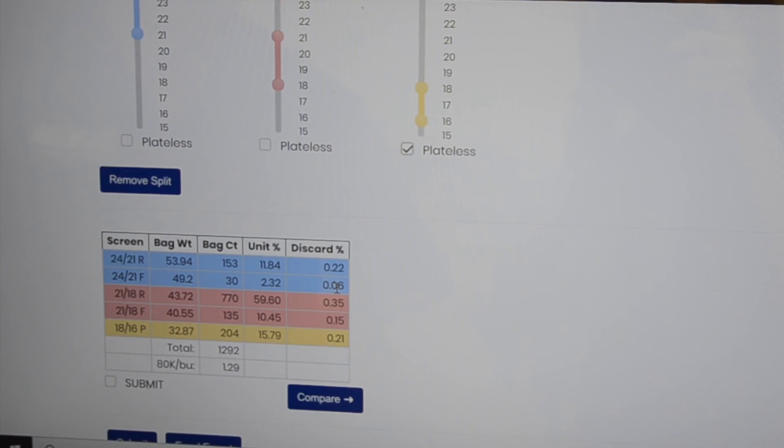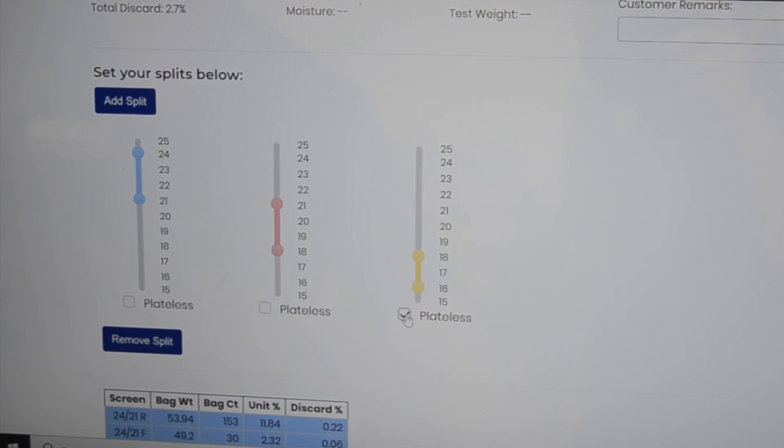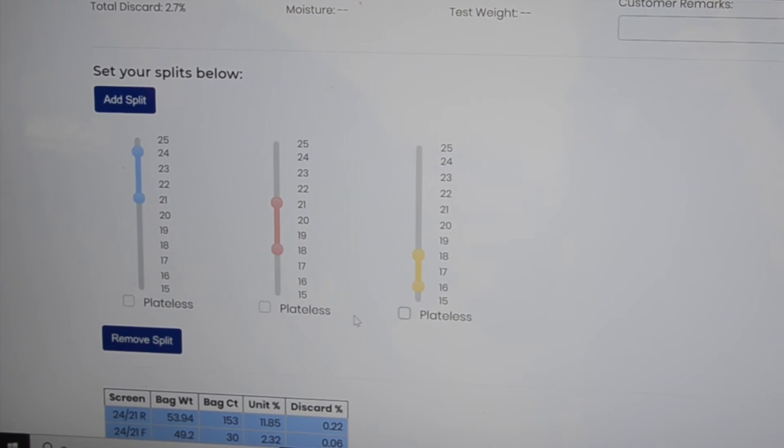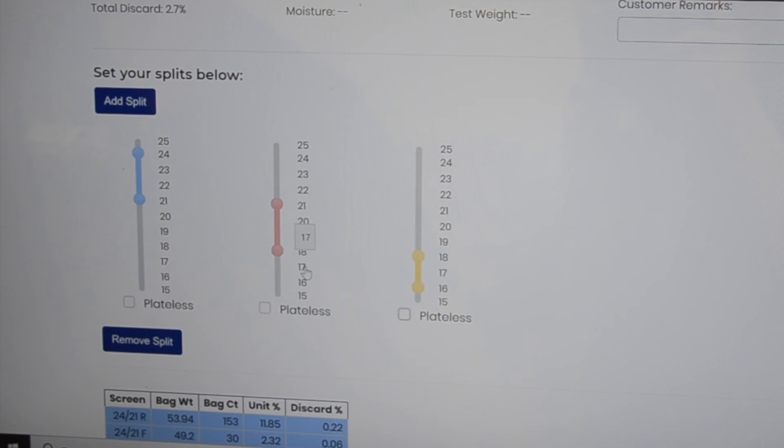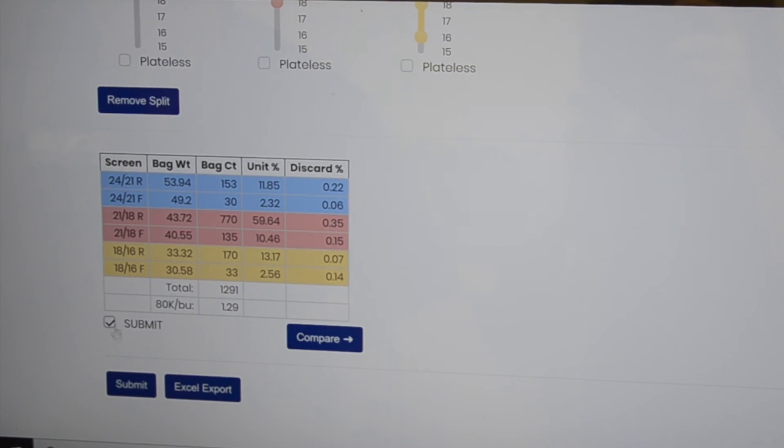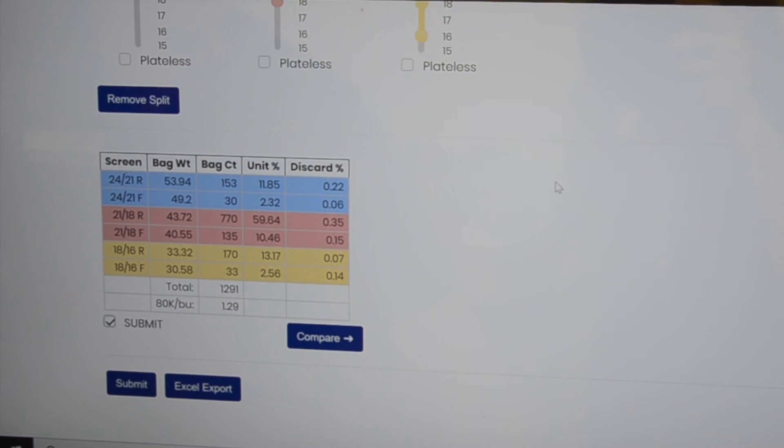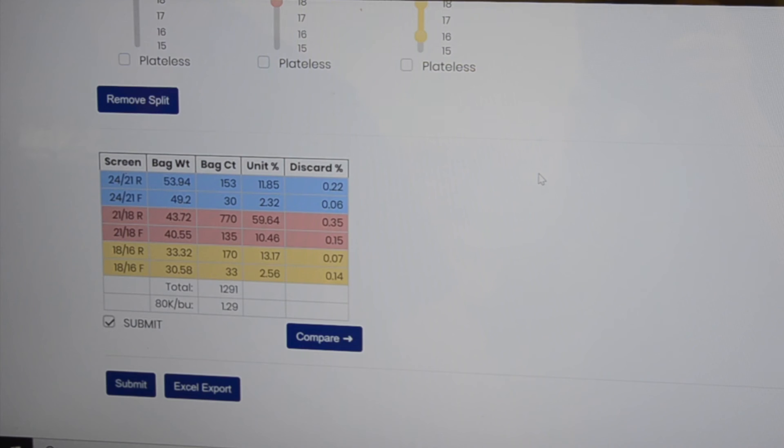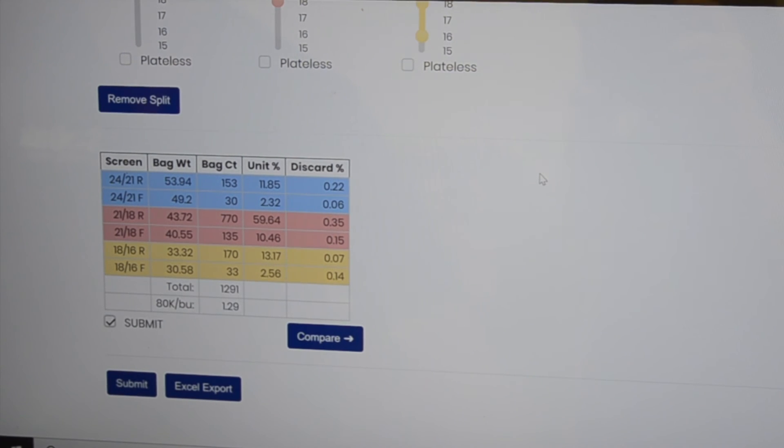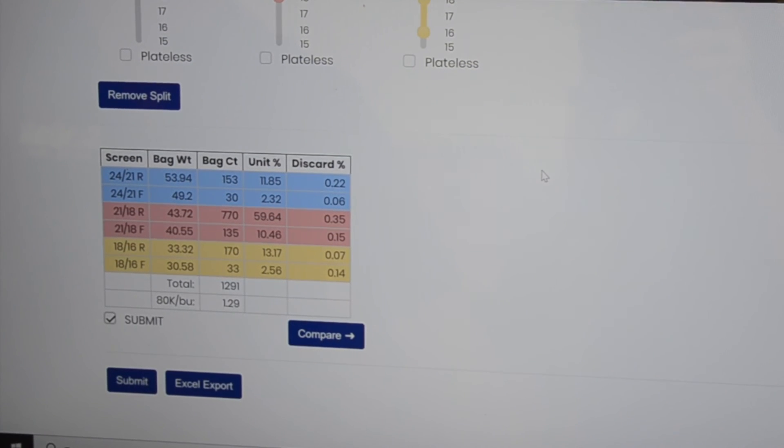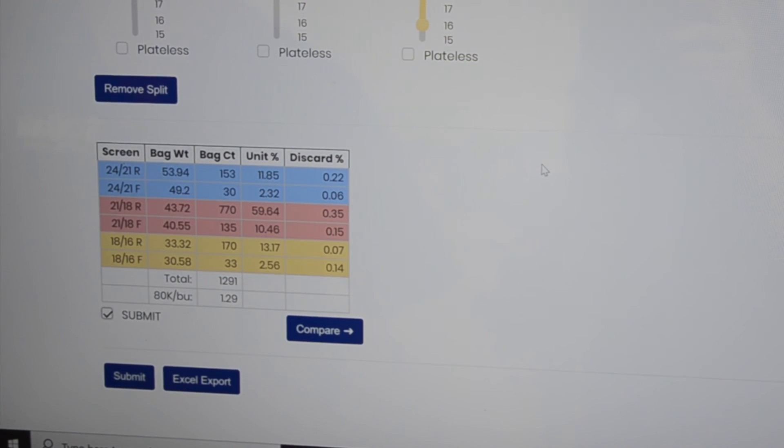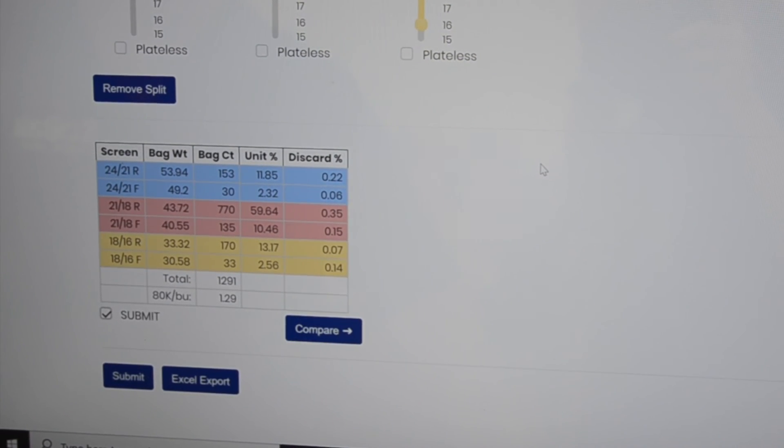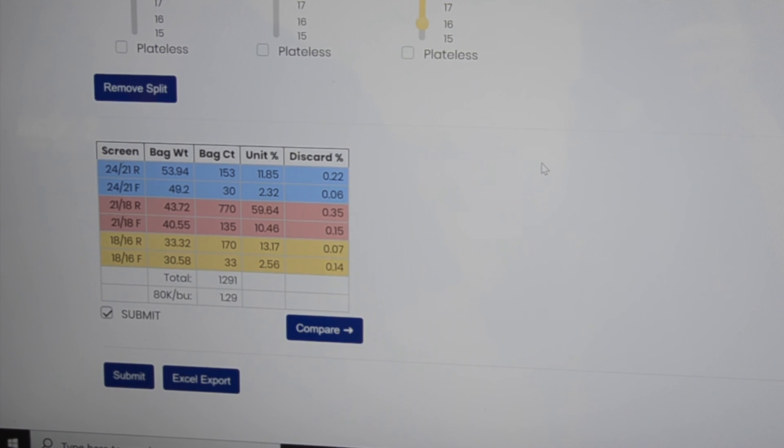Once you have decided what you want to do with this particular lot of seed, we need you to check the box and hit submit. Then you get a pop-up that tells you it has been successfully submitted to SODAC. At that time we can see what screens you have chosen, and we can size the seed and get it in test.